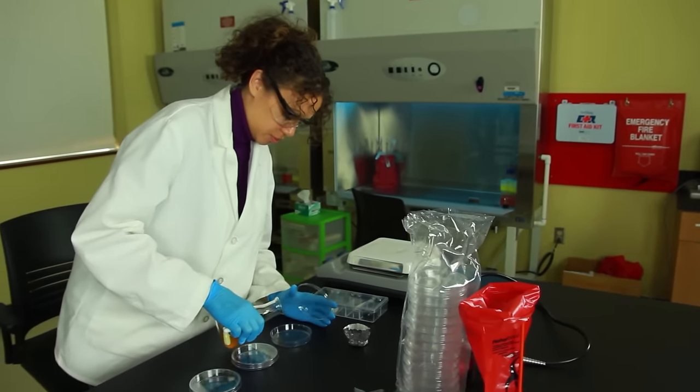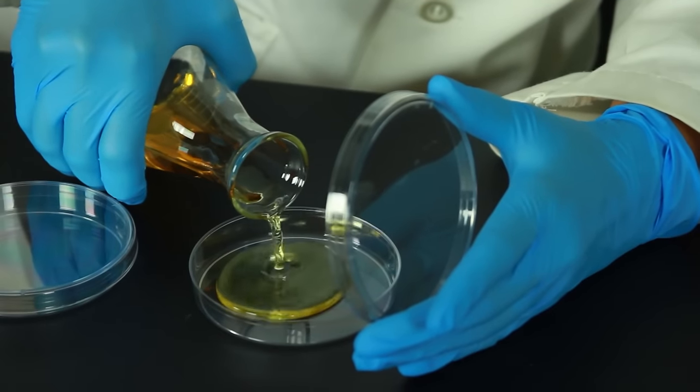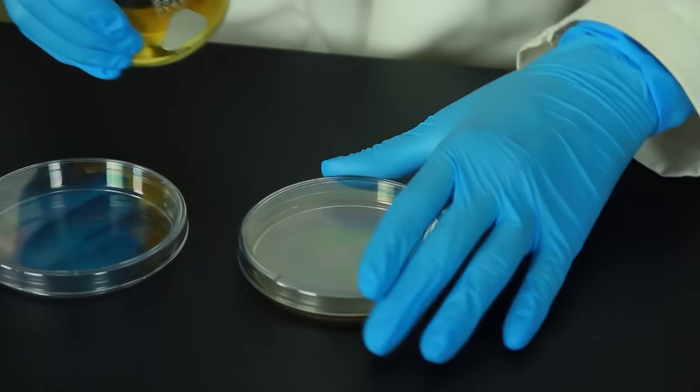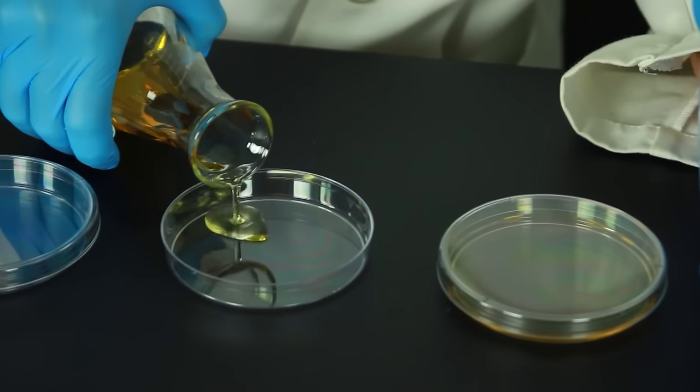Pour the media into the petri dishes. The amounts don't have to be exact, but be sure to cover the entire bottom surface, which is about 20 milliliters for standard size petri dishes.